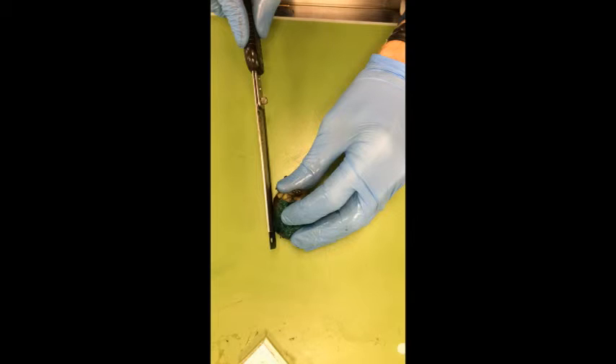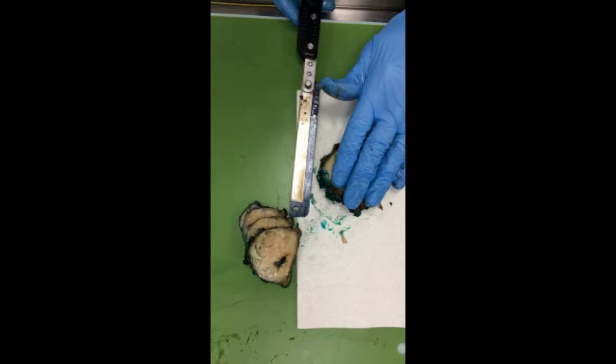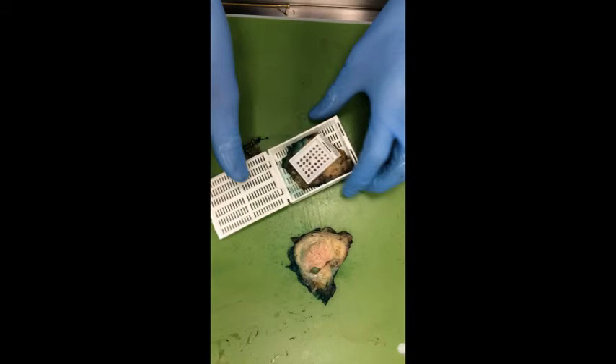Next, move to the prostate. Remove the urethral resection margin, place cut side down, and dictate this. Then slice the prostate — sometimes paper can be used for extra traction. Embed the whole prostate.